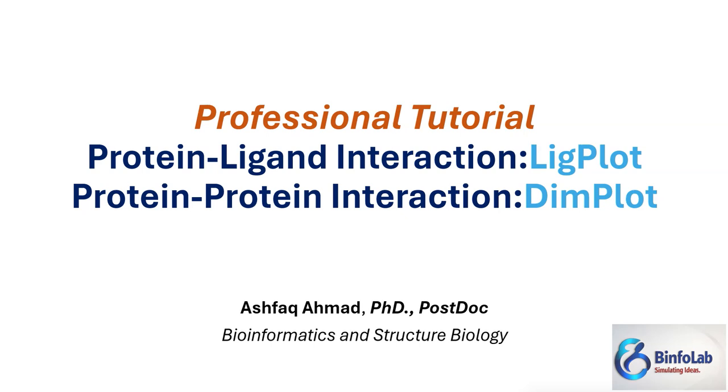Today we are going to cover LigPlot and DimPlot. Possibly you already know how to use LigPlot, but I named this video Professional Tutorial. That means I will teach you something new, easy and extra, which will make your life easier, in particular your research life easier, and you can work smartly using LigPlot. What we will cover in this video today, let's have a look.